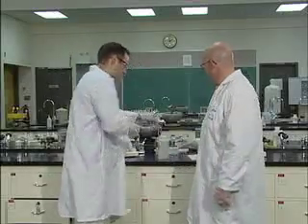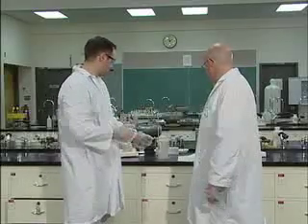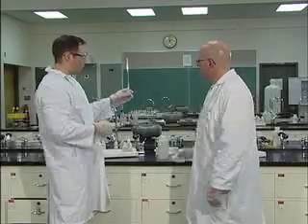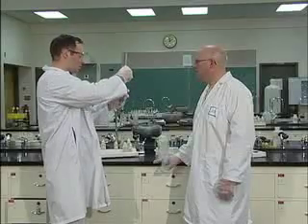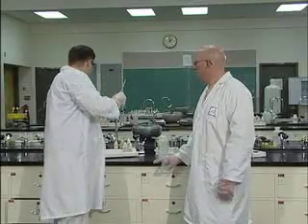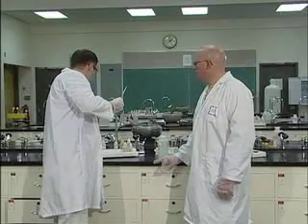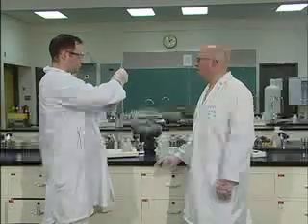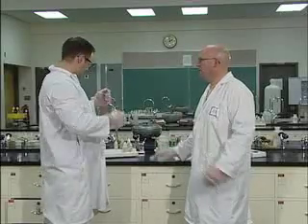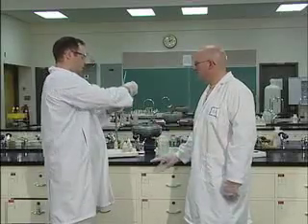Okay, now to that, you're going to keep the thermometer in the water. It says to add about 15 drops of calcium oxide. Now with the amount of water I have in here, that's going to be pretty tough. So if you don't think you can fit 15 drops of calcium oxide in there, take your thermometer out and just dump a little bit down the sink. In terms of quantity, a drop or two out is not a big thing. Not crucial at all.